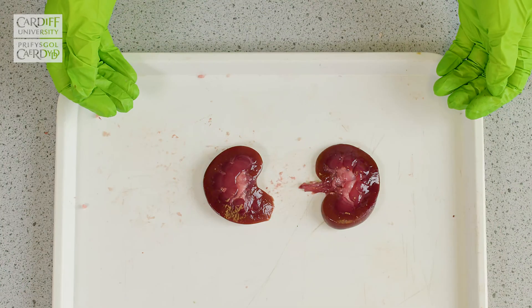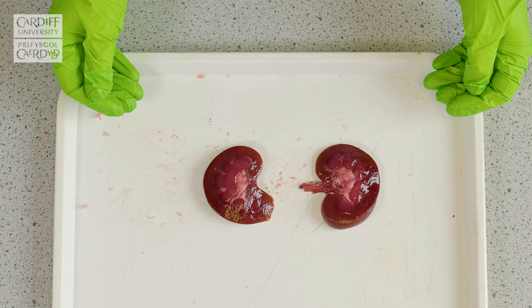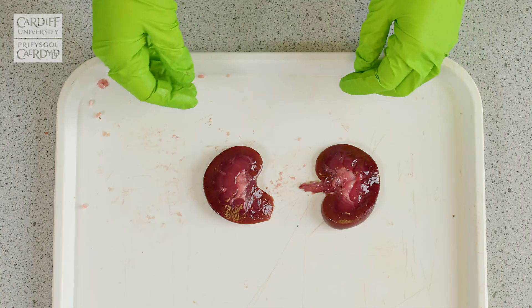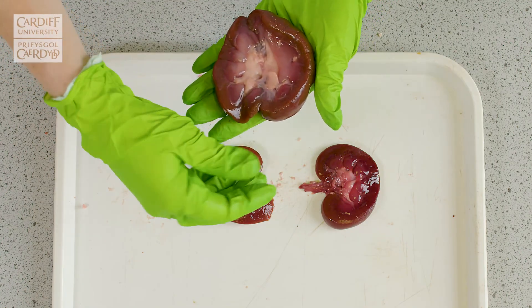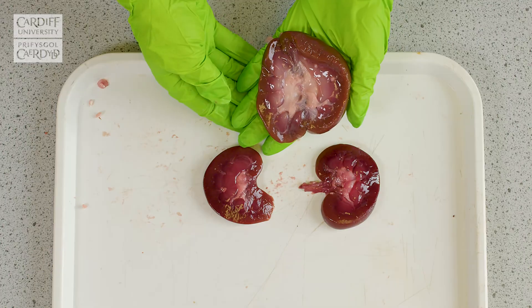One thing that's important to note is that every kidney, although it follows a similar structure anatomically, they might be quite variable with how they appear. So one that we dissected earlier is here, and we can show how, although structurally it contains the same units, it looks slightly different to the other one.